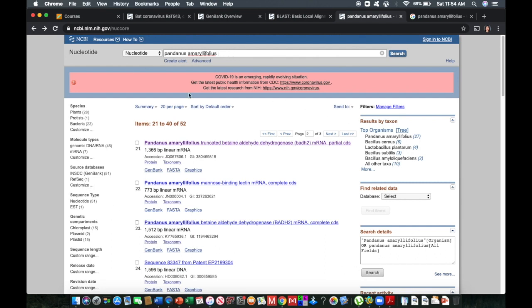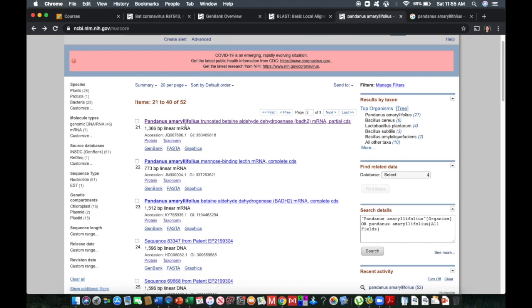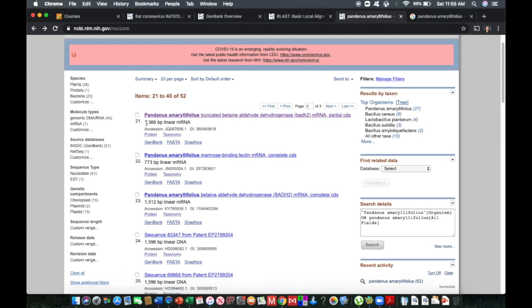So this is our search result for Pandanus amaryllifolius. So based on our search, you will see the interface, what particular information is given by this interface. So items here, focus. How many gene sequences are available in GenBank for Pandanus amaryllifolius? So we have here 52, a total of 52. So you have here the species name or the taxon name, the target region, accession number, and how many base pairs are there for this particular deposited sequence.